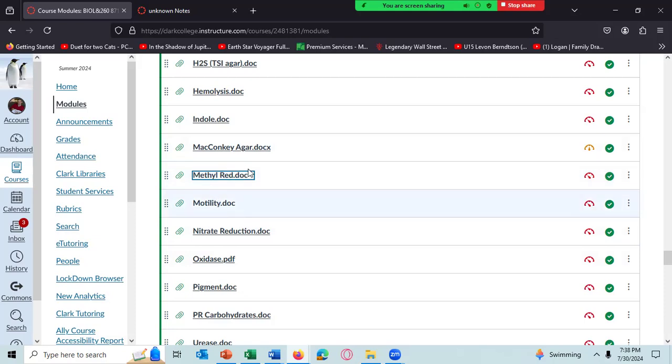And I'm going to start this test today, meaning I will pick your unknown number, and you're going to pretend that you're streaking it out. I'm not going to tell you the number until I send out your results for the gram stain, the gelatin hydrolysis test, and the PR lactose test. But you're going to actually start the gelatin hydrolysis test today, because you will not get the results for a week. And then let me see what I've got in the instructions here.